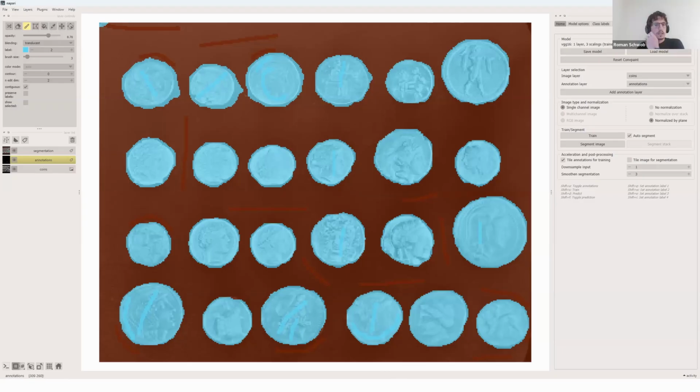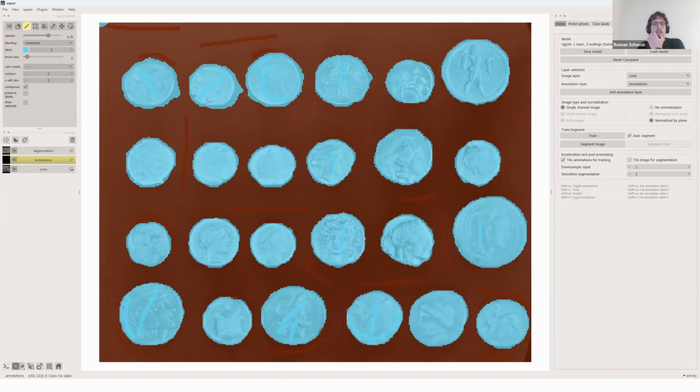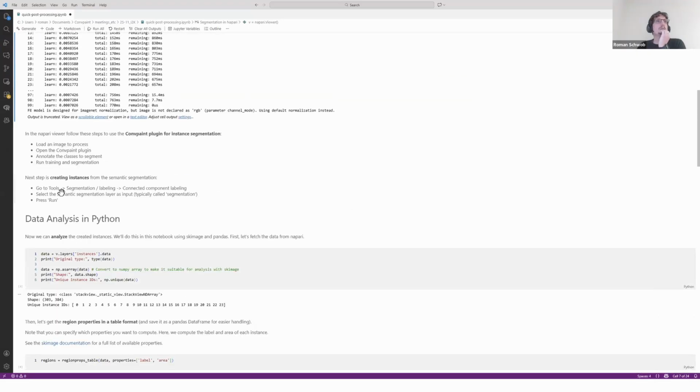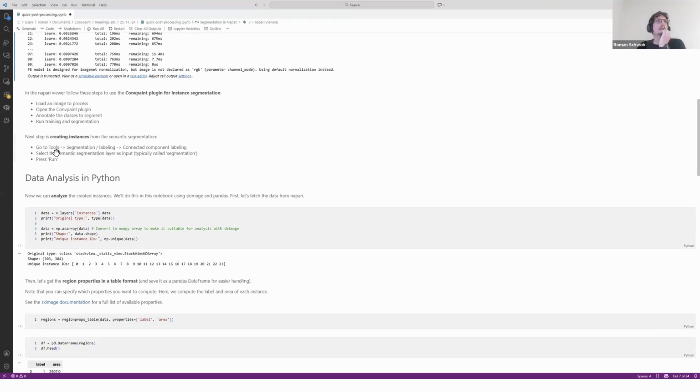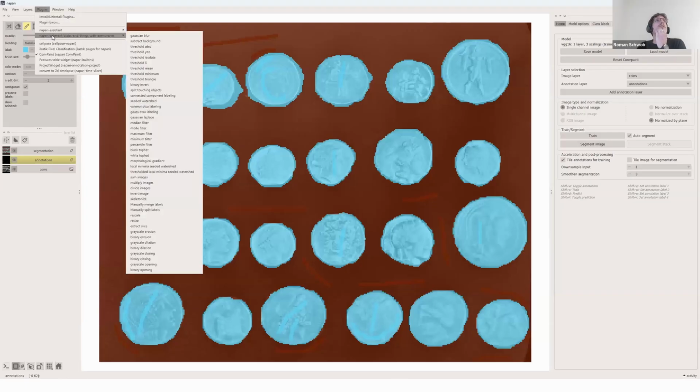So there's a very simple to use tool, also a plugin in Napari, which is called, I'll show you in the plugin, Napari segment blobs and things with membranes.